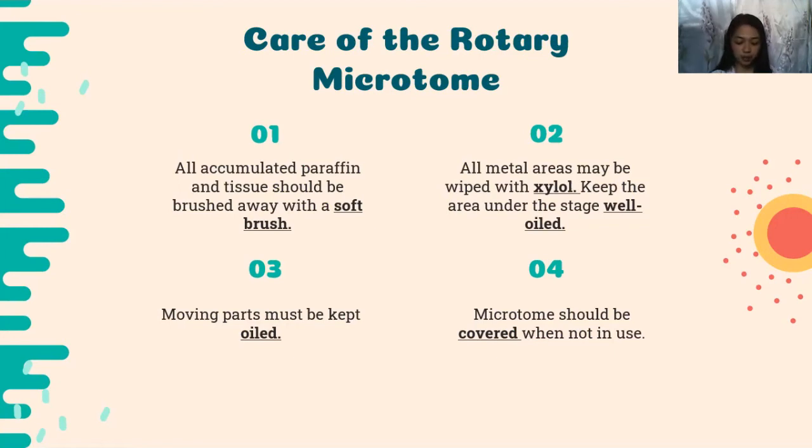Next, moving parts of the microtome must be kept oiled. And last, the microtome should be covered when not in use to prevent accumulation of dust and dirt which may interfere with the sectioning of the tissues.